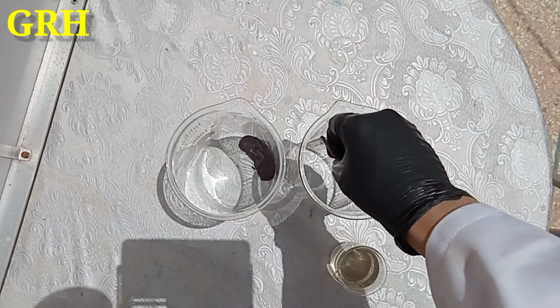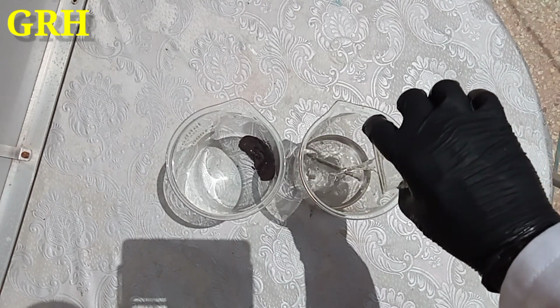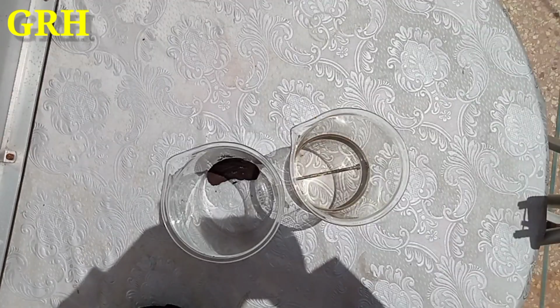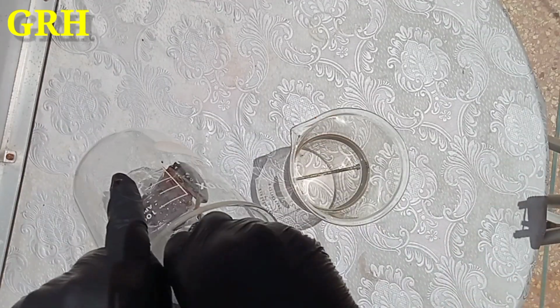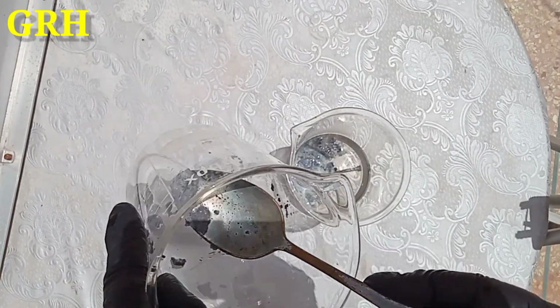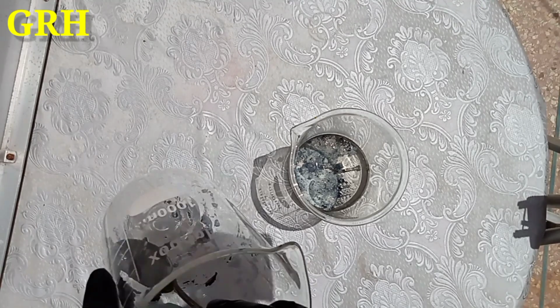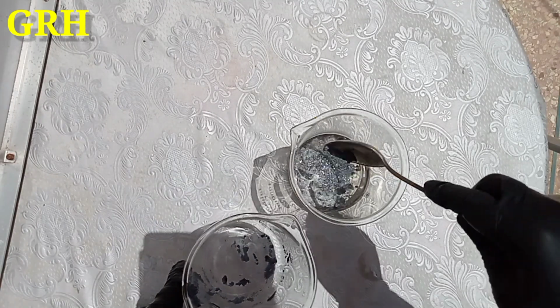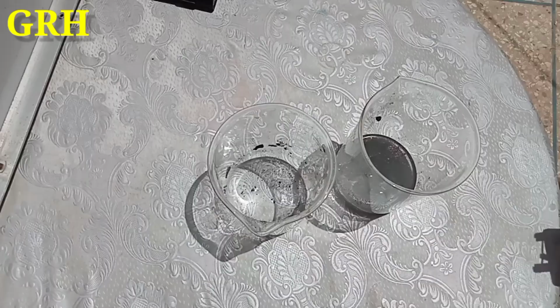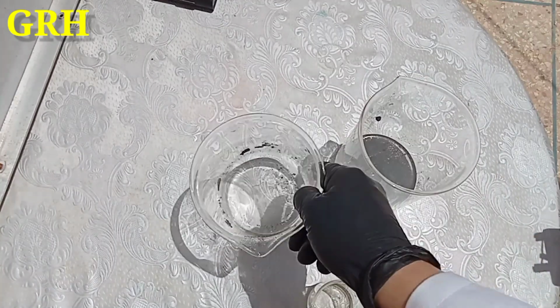In order to collect silver chloride, silver(I) chloride, in an easy way, we must add some iron to the beaker and pour sulfuric acid on it. In order to wash off the remaining silver chloride, I add a little bit of sulfuric acid.